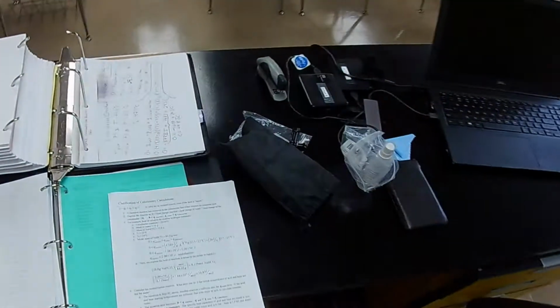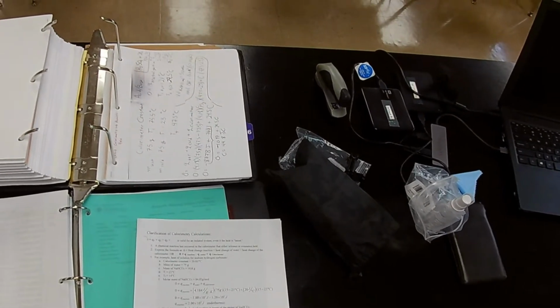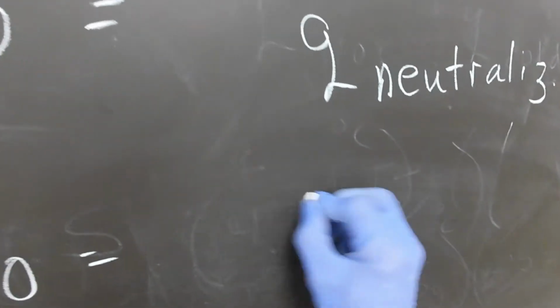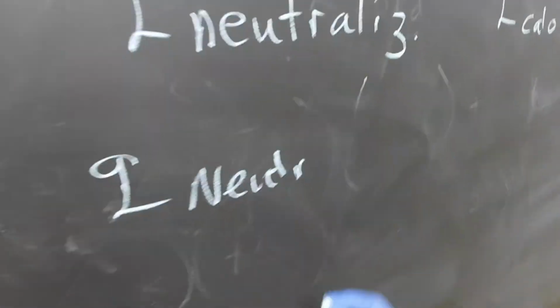My mistake. Let's see. This is Q for the reaction. Not G, Q. For neutralization. How much heat for neutralization?